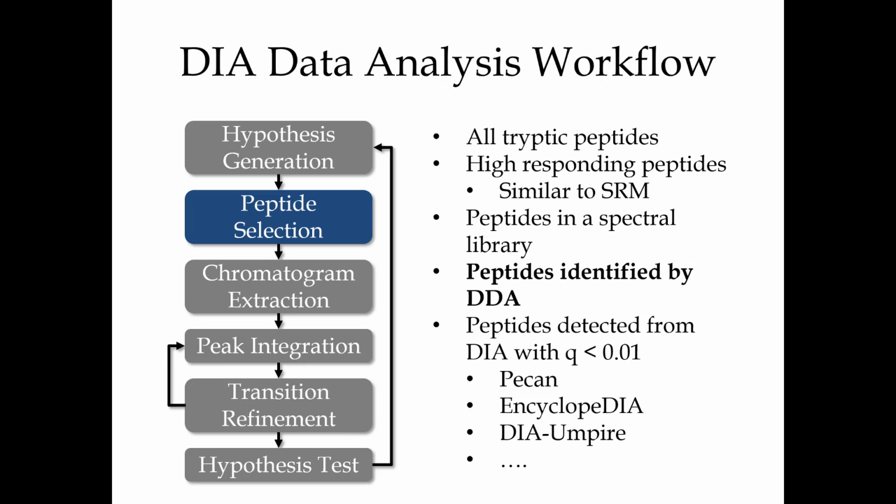I think tools that use DDA data tend to just go like, okay, you acquired the data, and we're gonna try to quantify everything out of that data, whereas you can do assay development prior to querying your high value data, your quantitative data. And then if you do that, that has an impact on the statistical tools, right? Because you've got a separate experiment. As long as you don't cycle, right? You don't go, oh, I learned some stuff from my quantitative data, I'm going to go back and refine my experiment, and then come back to this data again.